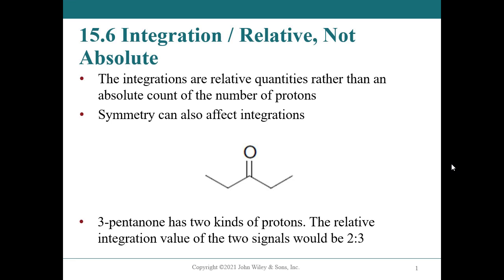So we'll go ahead and get started. We will continue with the NMR for proton NMR. We talked about identifying particular groups, which ones are unique, which are equivalent. And also we looked at chemical shift, determining, depending on the environment it's in, where we expect the various regions to be for the spectra.